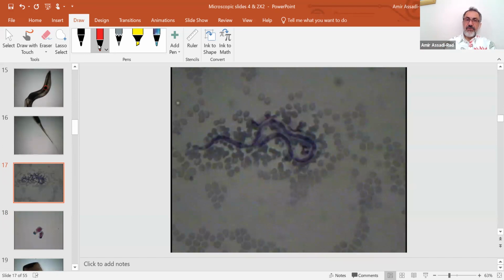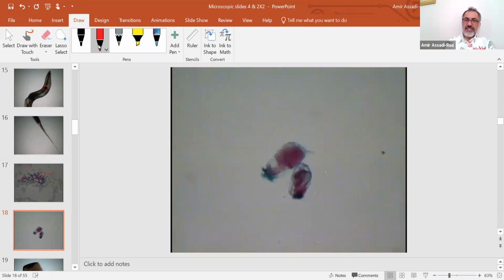This is the microfilaria of Dirofilaria immitis, common name dog heartworm, and around it, these are all dog's red blood cells. But this is the microfilaria. This is your Philodina, the corona right here, corona right here, and phylum Rotifera. This is the body, and this is the tail.